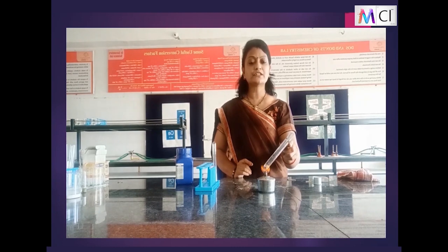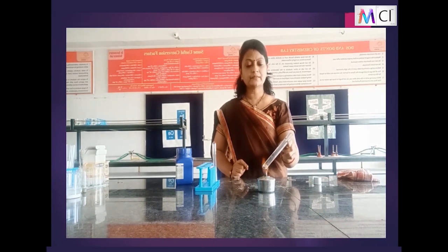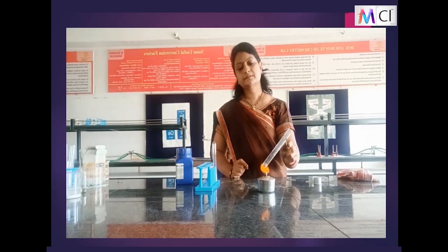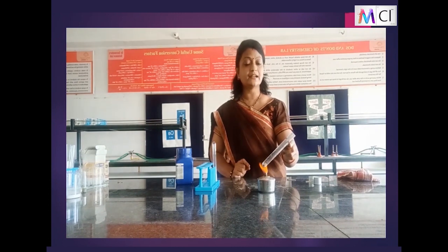Hear it carefully, children. There is a small crackling sound that can also be heard. So FeSO4, when it is heated, breaks down into Fe2O3, that is ferric oxide, and that brown color is nothing but the ferric oxide.